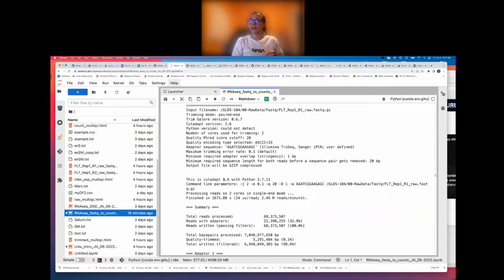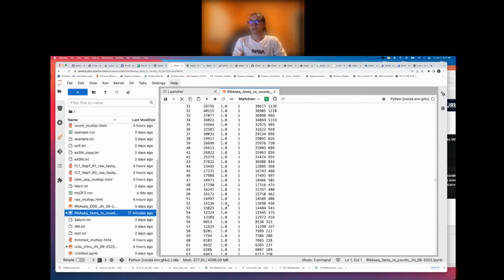And then after it's done the filtering for all the forward reads and all of the respective reverse reads, then it'll see, okay, for each insert that we sequenced in the forward and the reverse, how many base pairs are left in that forward read compared to that respective reverse read. And if either one, the forward read or the reverse read, is less than 20, it gets rid of both the forward and the reverse read. Does that make sense to people?